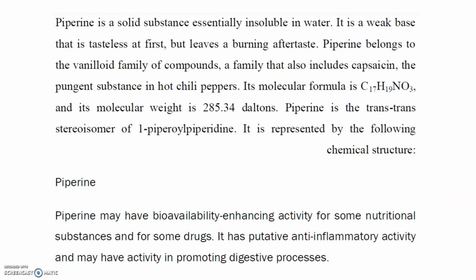Now friends, piperine is a solid substance, essentially insoluble in water. It is a weak base and is tasteless at first but leaves a burning aftertaste. Piperine belongs to the vanilloid family of compounds, a family that also includes capsaicin, the pungent substance in hot chili peppers.